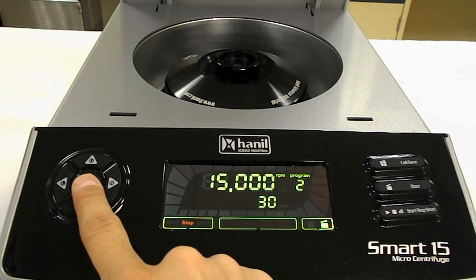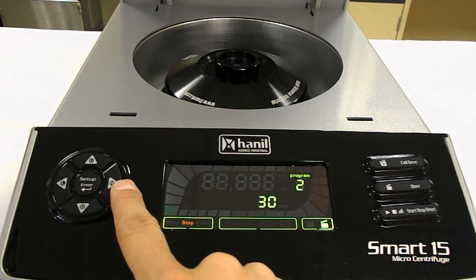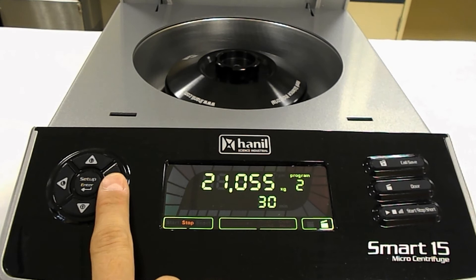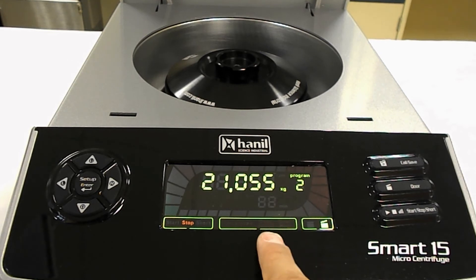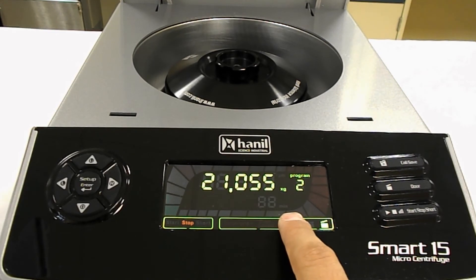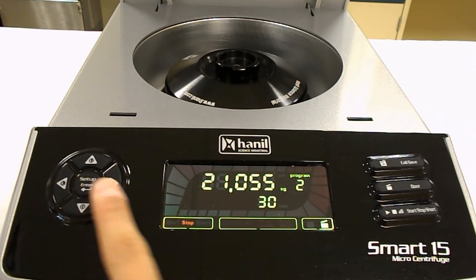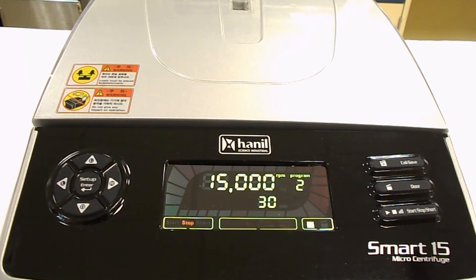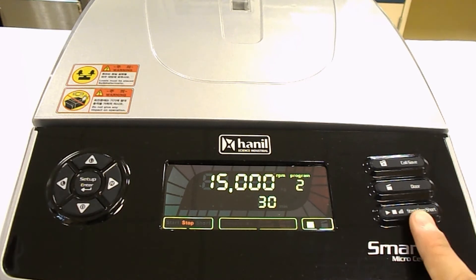As I hit the setup button again, the RPM values should blink, and I'm already set at the maximum RPM. If I continue to cycle through, I'll see the RCF values, which I can change — that's currently set at its maximum force. Cycling one more time gives me the timer values. Right now it's set at 30 seconds; the minute indicator is not flashing, which means it's set to seconds rather than minutes. I'll hit it one more time, then close the lid, which closes automatically — you heard that click. All I have to do is hit this button to start the operation, and it will run at top speed for 30 seconds.